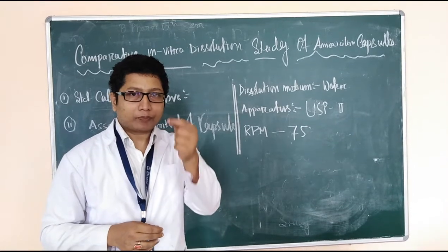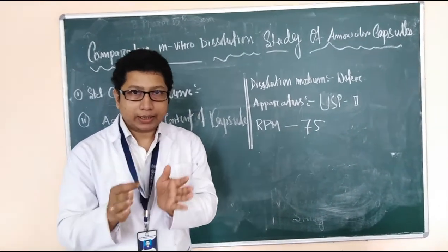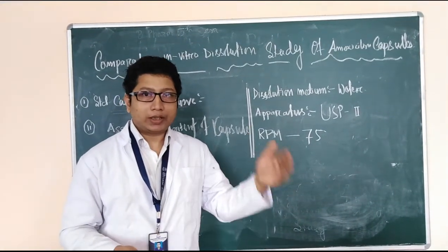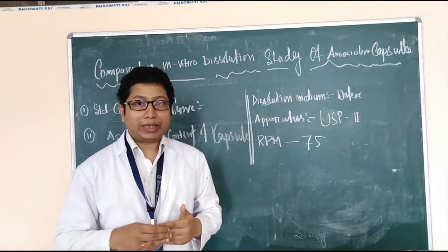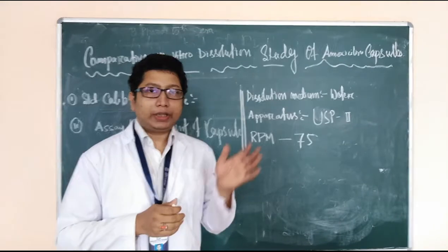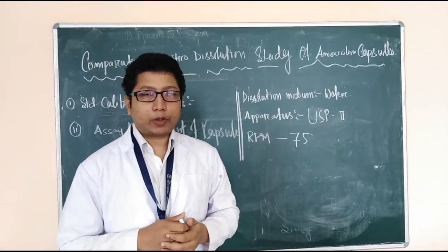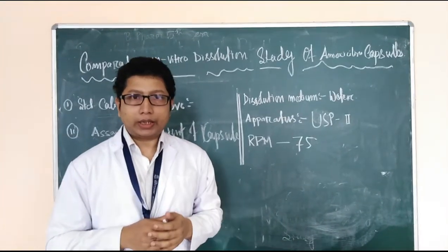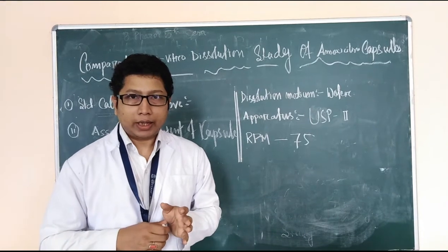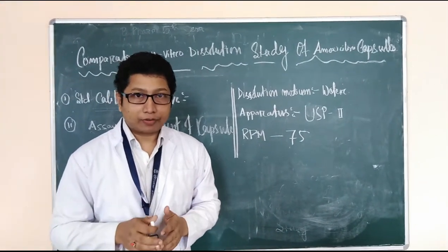I will take 1 ml of the standard solution, and do the necessary dilution to get solutions of known concentration with gradual increase. For these solutions we will determine the absorbance value in the UV visible spectrophotometer, and after determining the absorbance value, we will plot absorbance against concentration in a graph to find the standard calibration curve.